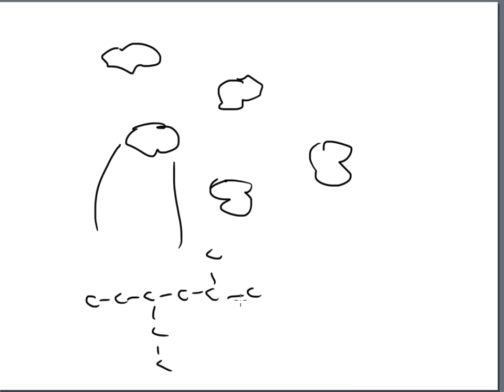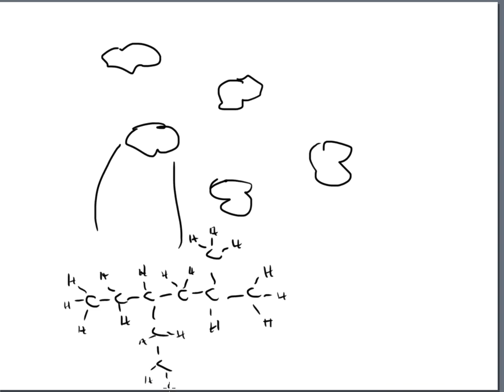And now you need to go into this realizing that each one of these carbons has hydrogens on it. There's a hydrogen here, and a hydrogen there, and a hydrogen here. There's one here, there's one there, and there's one there. There's one here. There's 2 here to make 4 bonds. There's one there. There's one here, one there. There's 3 on this carbon to make it a total of 4. There's 2. And here's 3. Folks, that's a lot of hydrogens here, right?